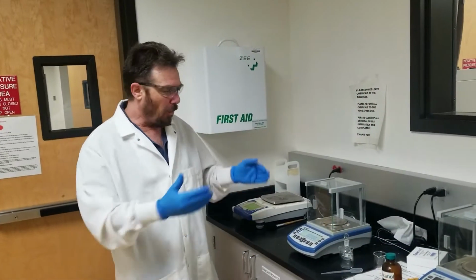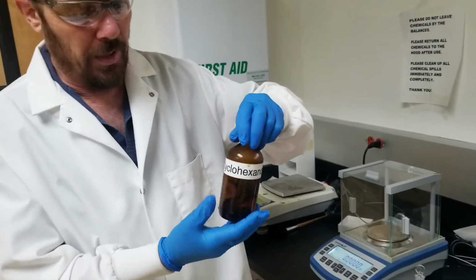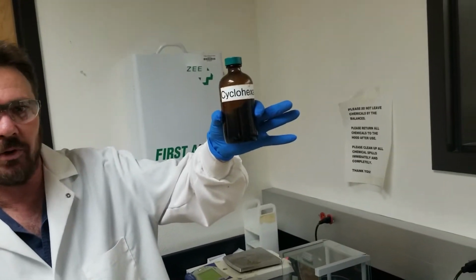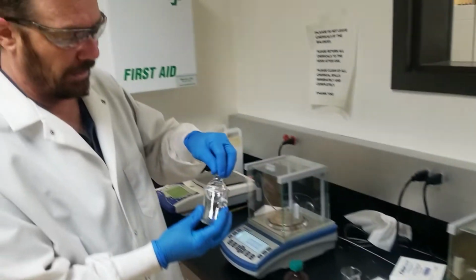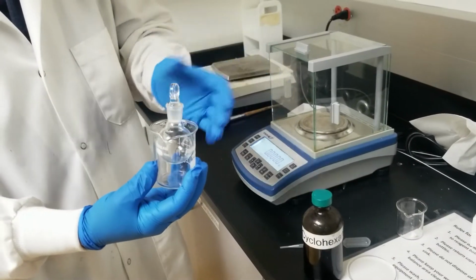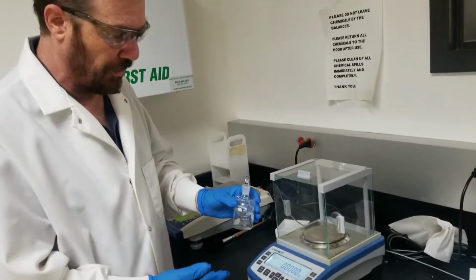Okay, so we're going to weigh out our cyclohexanol here. This has been warmed up because it's actually a solid at room temperature, so it just needs a little bit of warming so we can liquefy it so it's easier to handle. Here we have a flask, and I'm using this just to hold it. And then we have this. This is fairly volatile, so we want to keep a lid on it after we weigh it. Now we're going to weigh this by difference. You could put it on here and tare it, but we're just going to do it by difference.